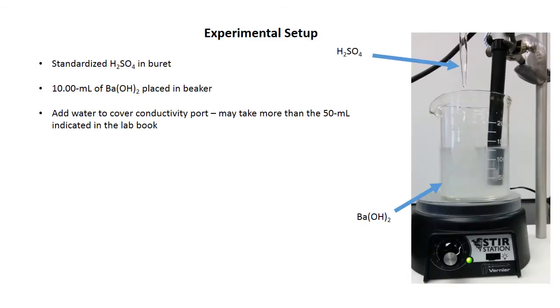The setup for the experiment isn't very complicated. You've seen this sort of thing before. Up in the top is your burette that will have your sulfuric acid. This is the Vernier conductivity probe sticking into the solution. This is the barium hydroxide solution. I was a little impatient so it's a little cloudy. Yours won't be cloudy when you get it.